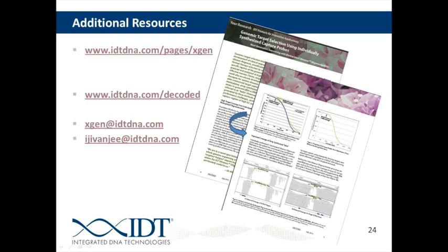So it's a matter of trial and error, and what I would encourage most people to do is to test the amount of material they have. Different manufacturers for different next-gen platforms have different ways of quantitating the amount of material that's needed. By following the manufacturer's instructions, test the amount of material that you have after PCR. If that's not enough material for the sequencing run, then you obviously need to do more cycles, and if there's excess material, then you can cut back on the cycles. But it's really something that doesn't have a clear answer of a certain number of cycles. You want it to be the minimum in order to get the data that you need. Exactly. Yep.